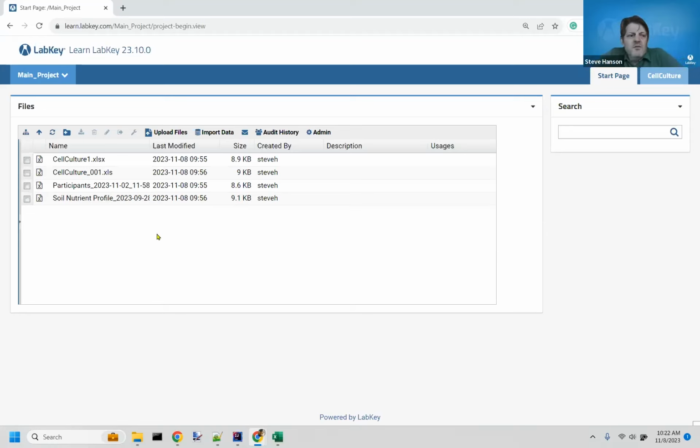Was there any other questions there, Will? Some other questions here. Another one asks, can projects modules interact with LabKey? Oh, are they separate? Yes, they're separate. I think we answered those. Oh, here was one. One we wanted to ask was, in a table, is it possible to have a column where the values are unique? Yes, I believe so.